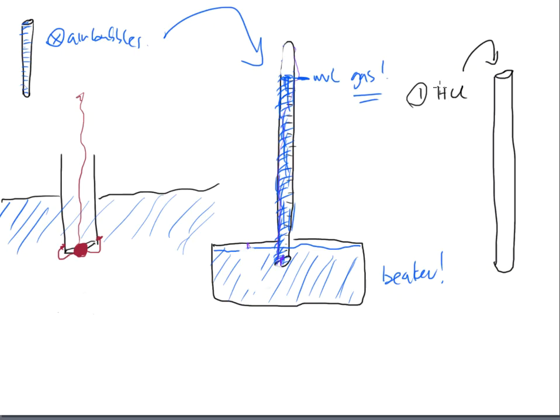And it says a handful of milliliters here. It tells you that in the lab directions. Use the eudiometer to read where that's at. All right, so here is my HCl, and that's at the very bottom. Nothing else is in there. That's it, just HCl.